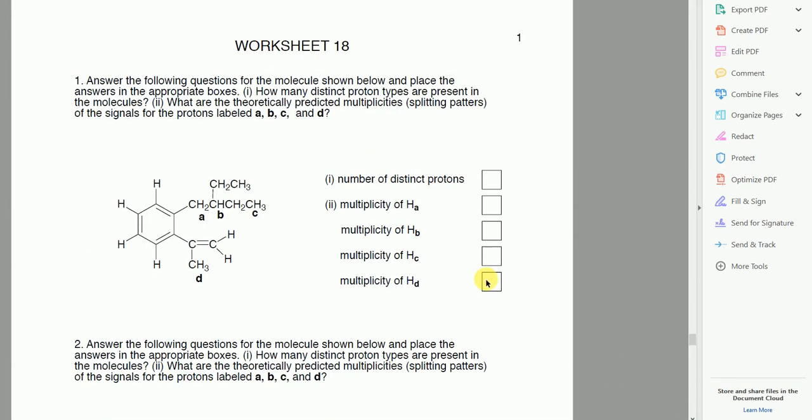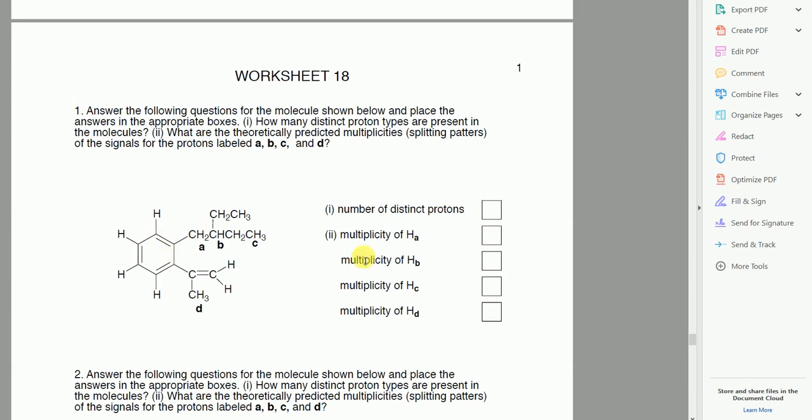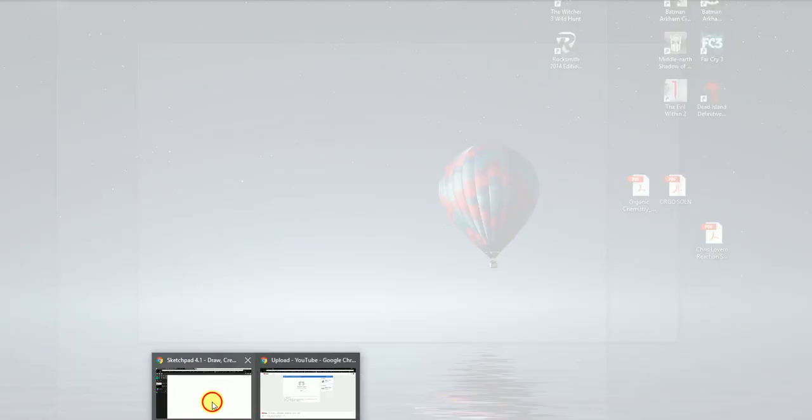This is very good. Okay, so this is strictly Proton NMR. And so what we're doing over here, we're looking at every single environment, all right? And the peaks are representative of the multiplicity values of those carbons. Okay, so what she's doing over here, she's saying you have carbon A, B, C, D, whatever, and we're looking at HA.